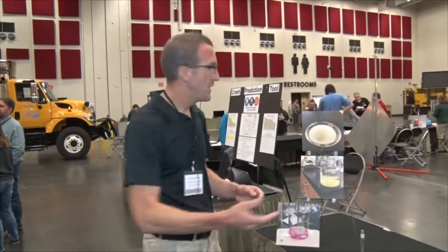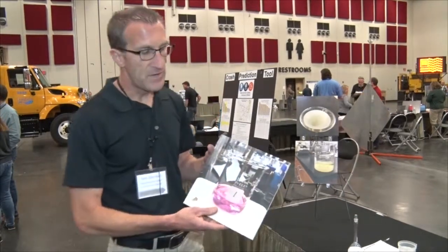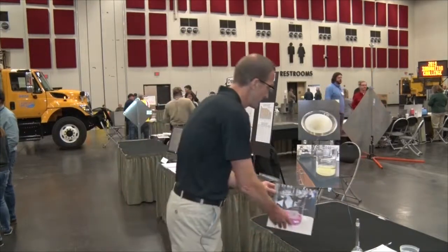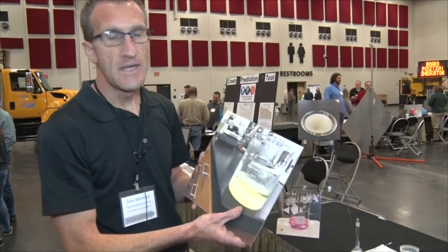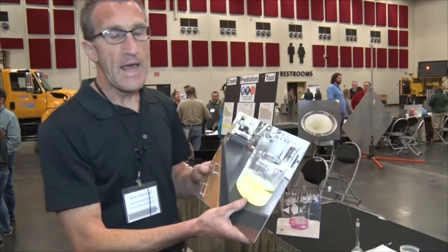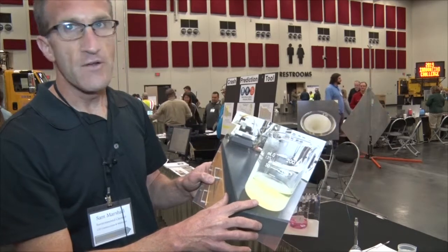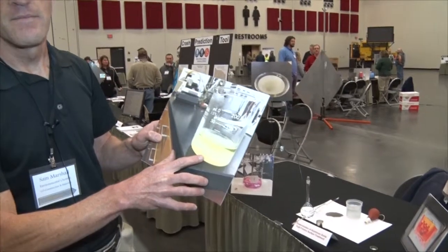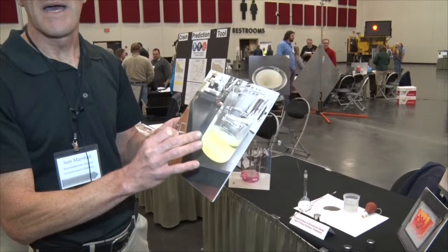When I take that sample, I transfer it to a beaker. And I add an indicator to it, which makes sure that it's acidic. From there, I will add ammonium hydroxide to it, and it'll turn this color, yellow. That tells me that it's basic. And what happens if you see this precipitate? This is what I'm looking for. What precipitates out is silica, aluminum, iron, phosphorus, and titanium, right? Those are the main minerals that are in bauxite.